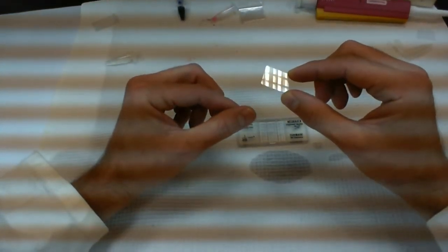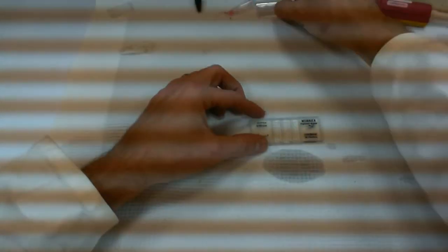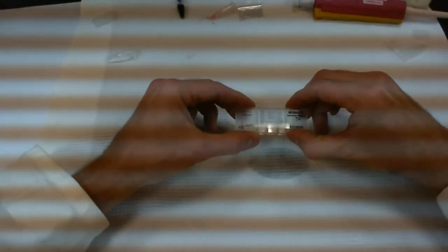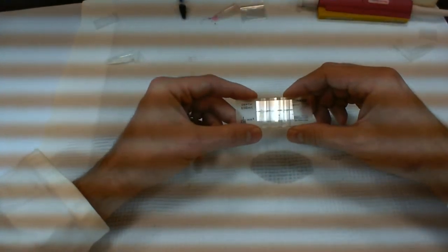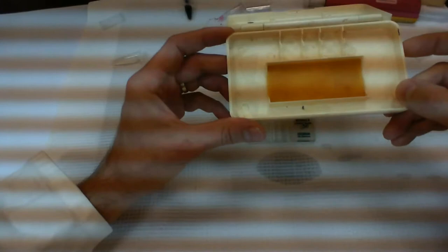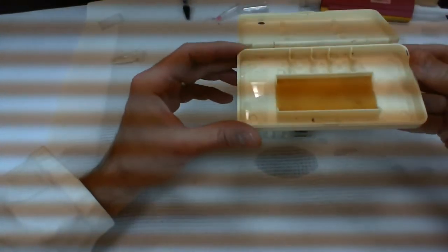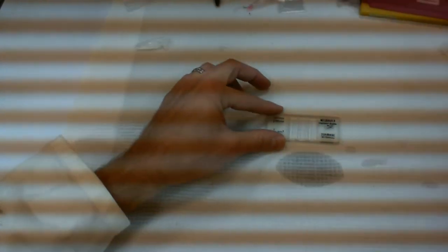Unfortunately, undergraduates tend to break them fairly quickly, and so what we tend to find is that in our teaching labs, most of these will just have a regular cover slip in there. In some cases, it's going to be a broken cover slip because, again, undergraduates are not very careful. So be very careful when you are applying the cover slip. I will show you in a moment the method.